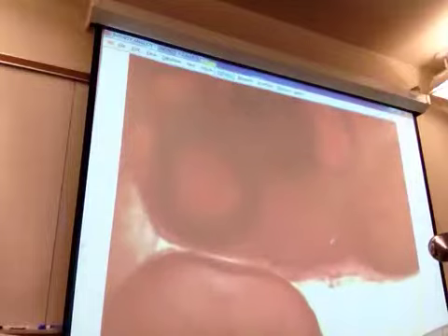Big embryo. Is that focused? That is focused. It's that thick of a slide. This is a giant embryo. This is actually its eye. You can see the brain here. Is eye acceptable or do you want optic? Eye would be acceptable. You can see here the somites have now started to turn into bits of early spine.